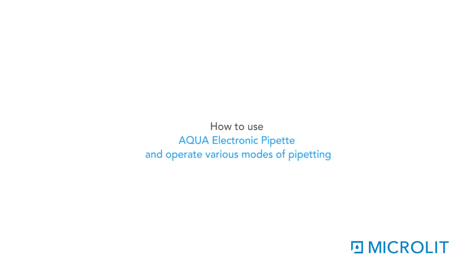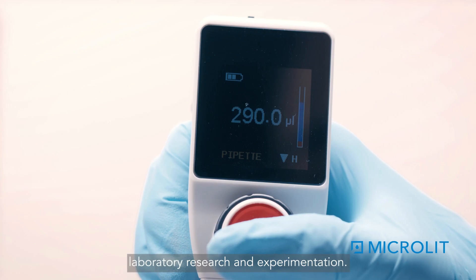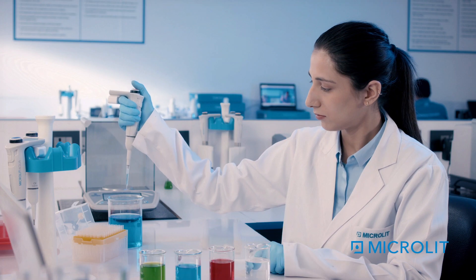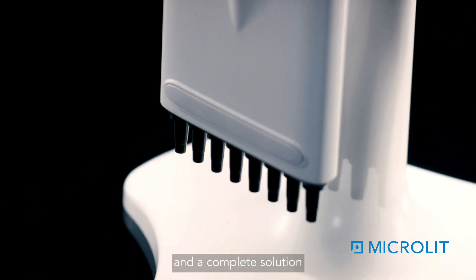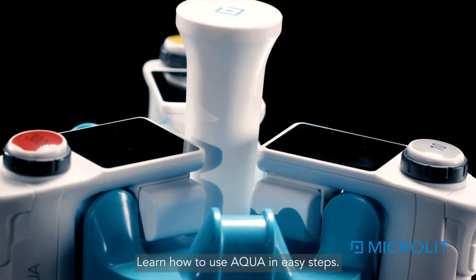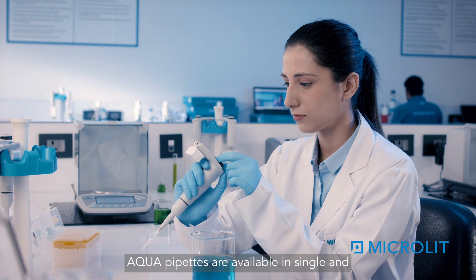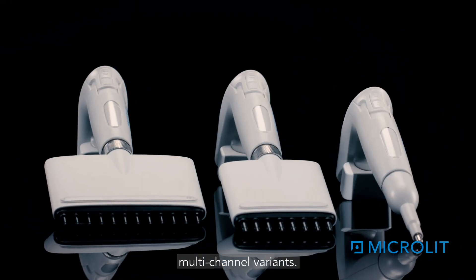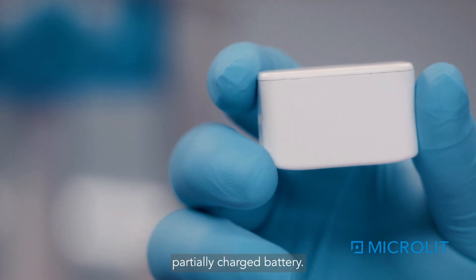Learn how to use the Aqua electronic pipette and operate its various modes of pipetting. Let's introduce this state-of-the-art design — a complete solution for all your pipetting needs. Aqua pipettes are available in single and multi-channel variants and are supplied with a partially charged battery.